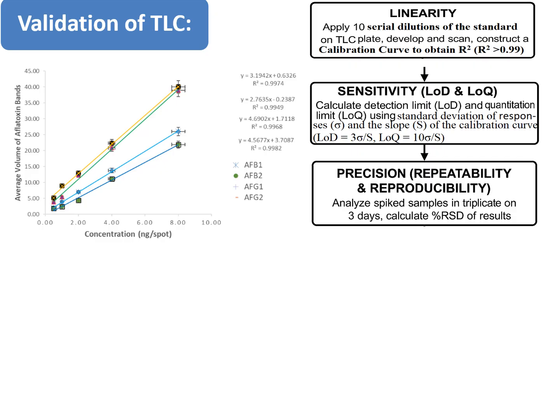Usually, precision is evaluated at 3 or 2 levels based on repeatability of the method or reproducibility of the method, or intraday precision of the method.